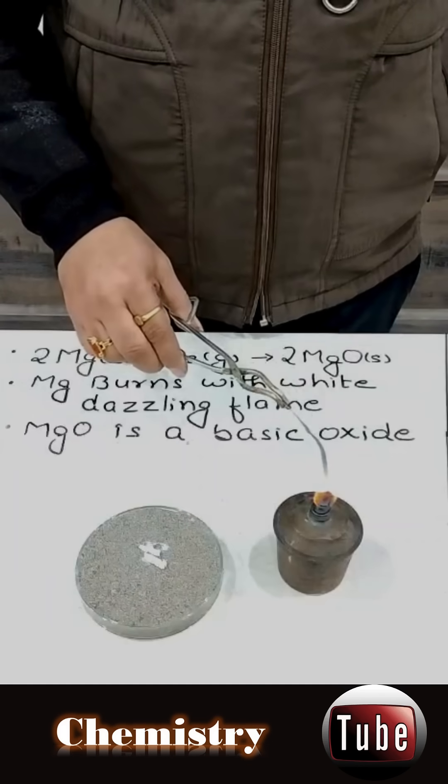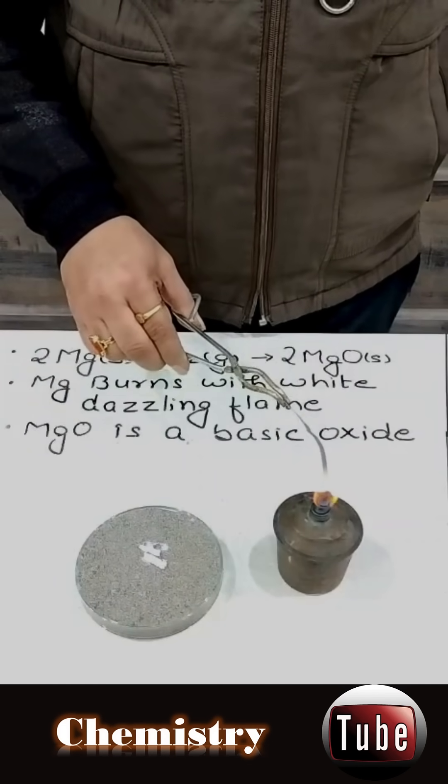Let us try to burn this magnesium ribbon. Let it reach its ignition temperature.